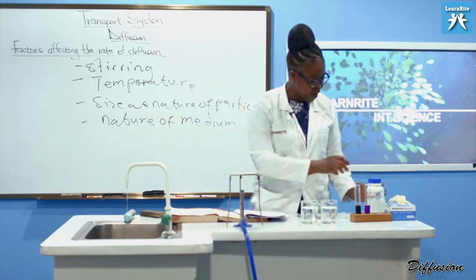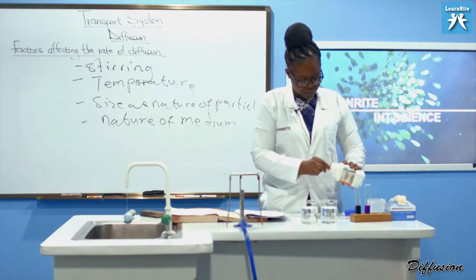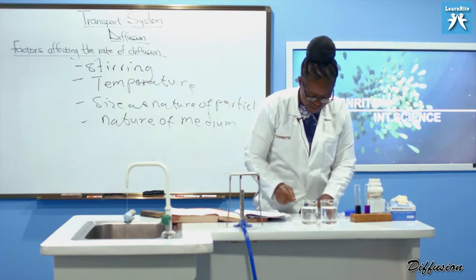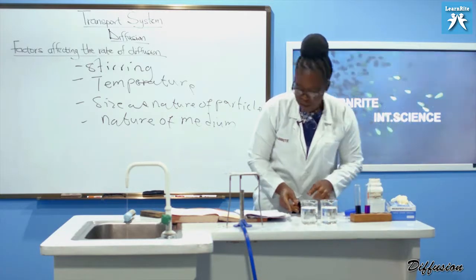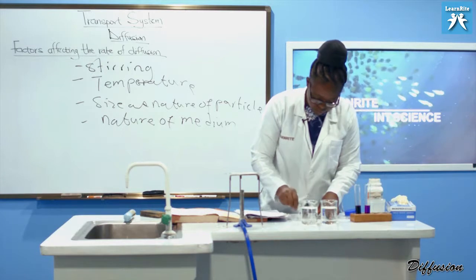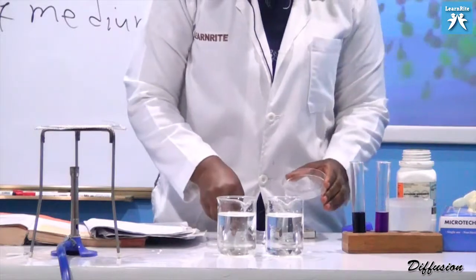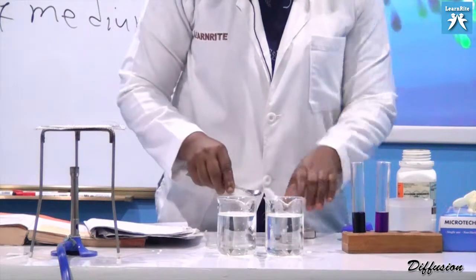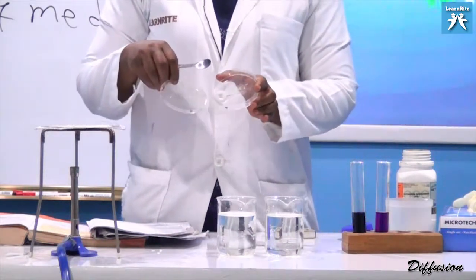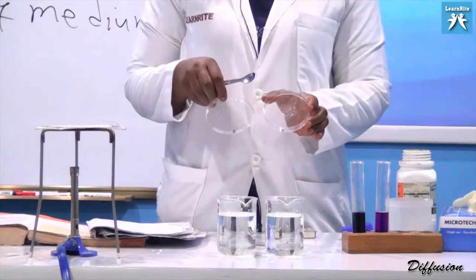And I want to use my usual potassium permanganate. Yes, I still have some here. I'm going to grind. I hope you can see it. Are they of the same size? No. Let me change this one so that you do not conclude that one was bigger than the other. So look at the sizes. I said how big or how small the particle you are dealing with is known as the size. So I hope you've seen them.